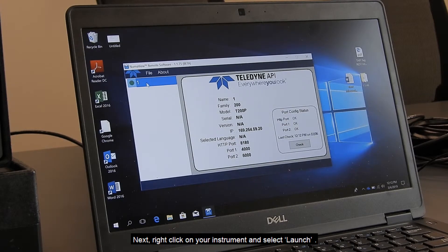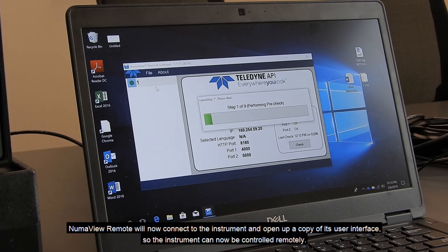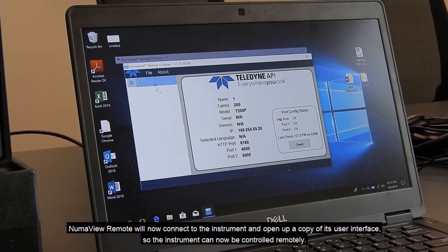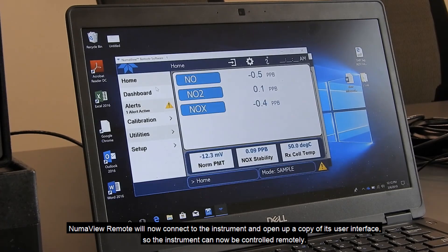Next, right-click on your instrument and select Launch. Numaview Remote will now connect to the instrument and open up a copy of its user interface, so the instrument can now be controlled remotely.